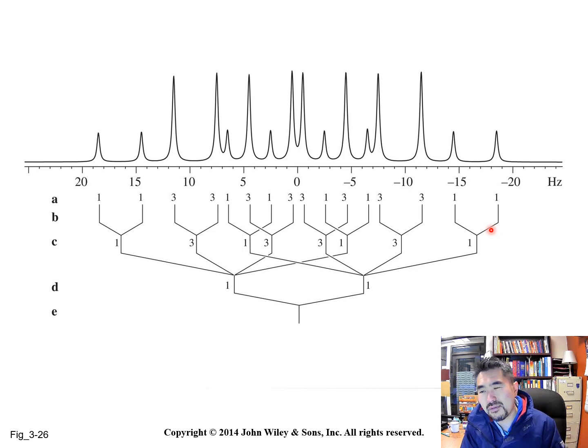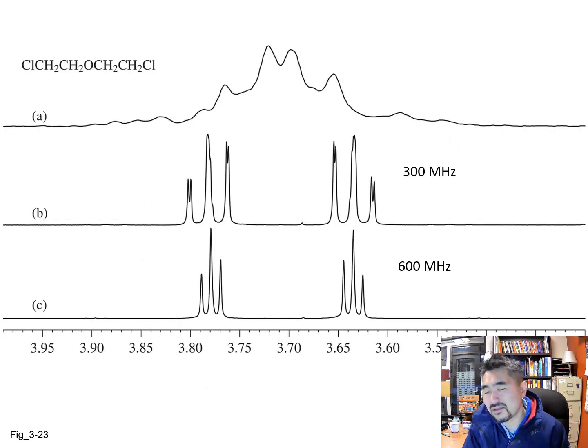Now you might ask, why don't we see a sextet, or 6 peaklets? That's because some of the protons have either large or small coupling constants. One proton splits by this much. One type of 3 protons splits by only this much into a quartet, and then finally one proton splits by only this much. So it's a doublet of quartets of doublets, or technically, usually people say doublet of doublets of quartets. So ddq is what you might see in the literature.